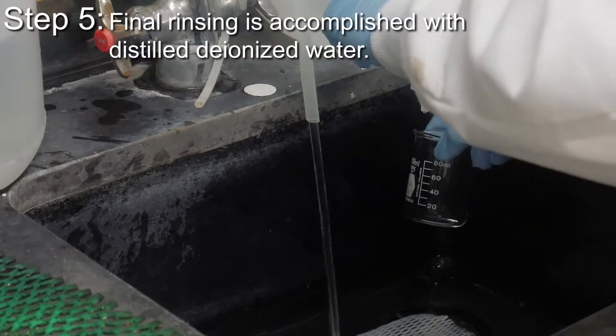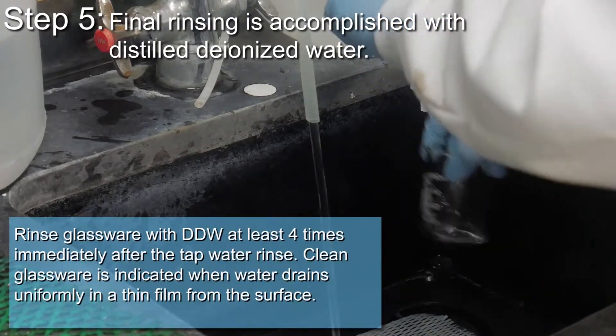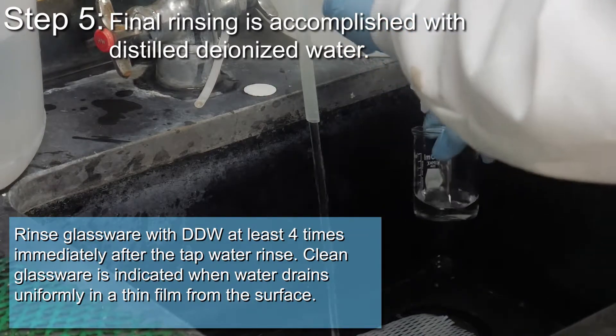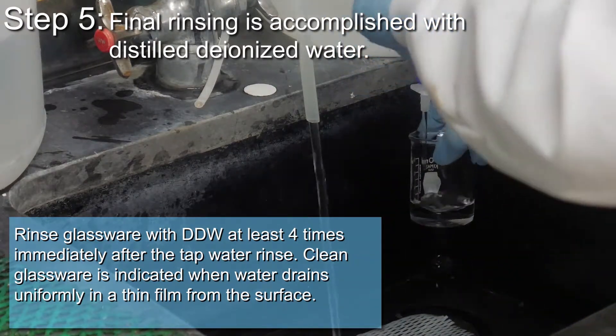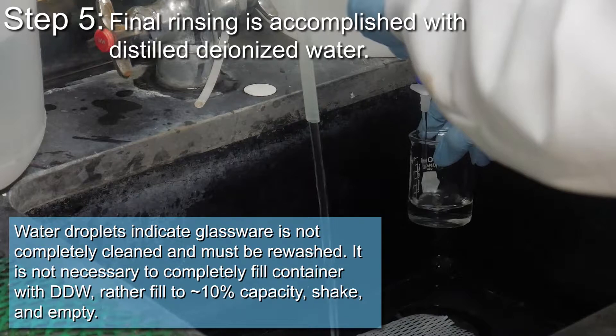Final rinsing is accomplished with distilled deionized water. Rinse glassware with distilled deionized water at least 4 times immediately after the tap water rinse. Clean glassware is indicated when water drains uniformly in a thin film from the surface. Water droplets indicate glassware is not completely cleaned and must be rewashed.